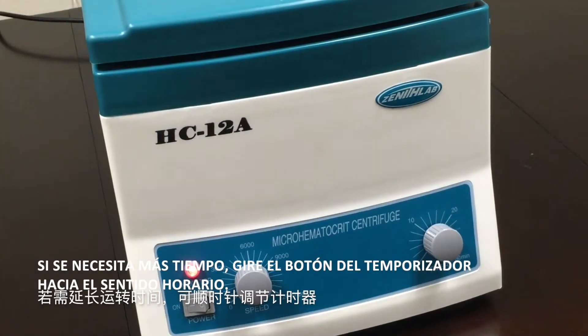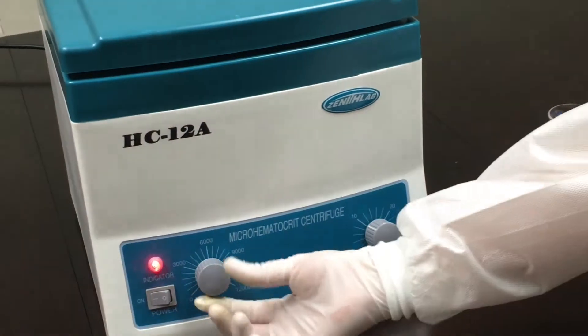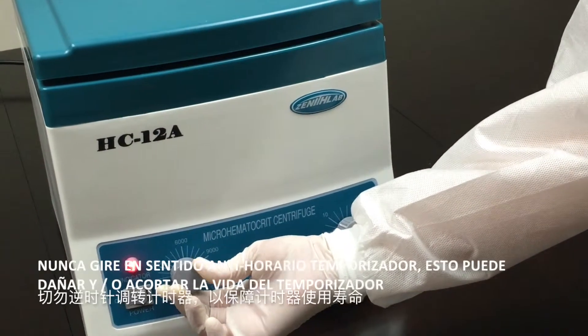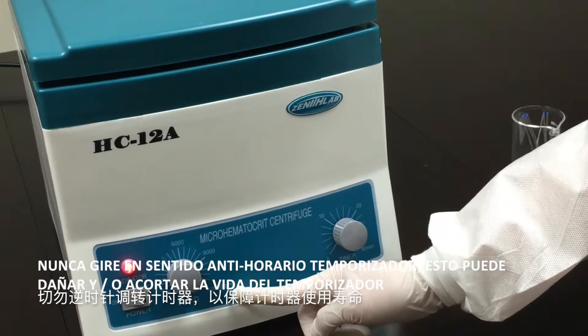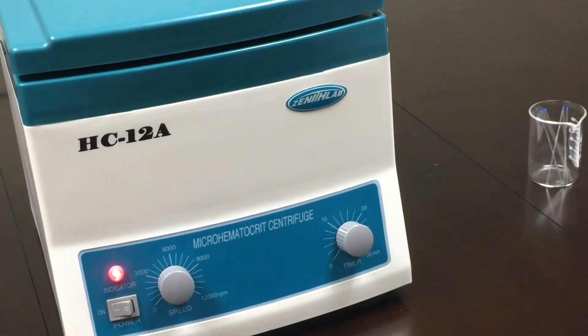If more time is needed, turn the timer clockwise. Never turn the timer counter-clockwise, as this can damage and or shorten the lifespan of the timer.